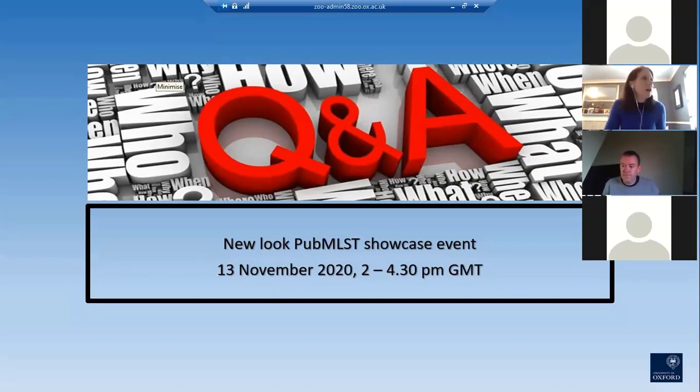Rafael Ibrahim says, what format of sequence is PubMLST accepting? FASTA files or FASTQ files or both? FASTA. We only deal with assembled data. We don't handle short reads on the site.